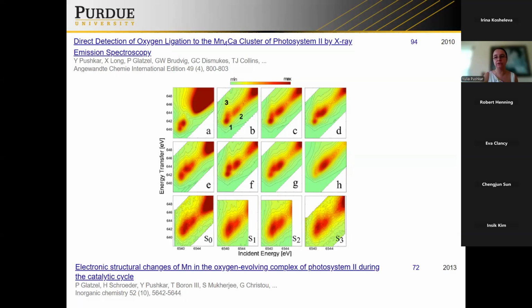We were trying to figure out all those electronic transitions, but as you see, blobs don't really differ that much from each other. So it was another like 2 weeks of beam time with thousands of samples, but it was only one paper in Inorganic Chemistry after many years of data analysis, because to your eye, you see blobs don't really change much. And maybe it's again like 1 eV resolution, maybe the higher resolution is needed, maybe some other lines should be observed.